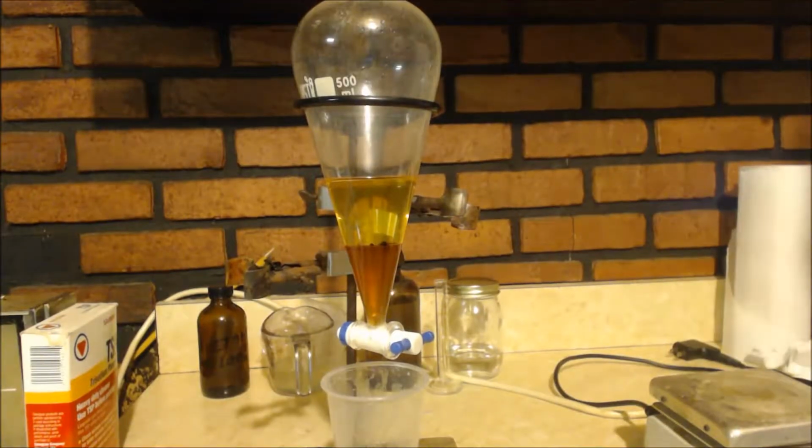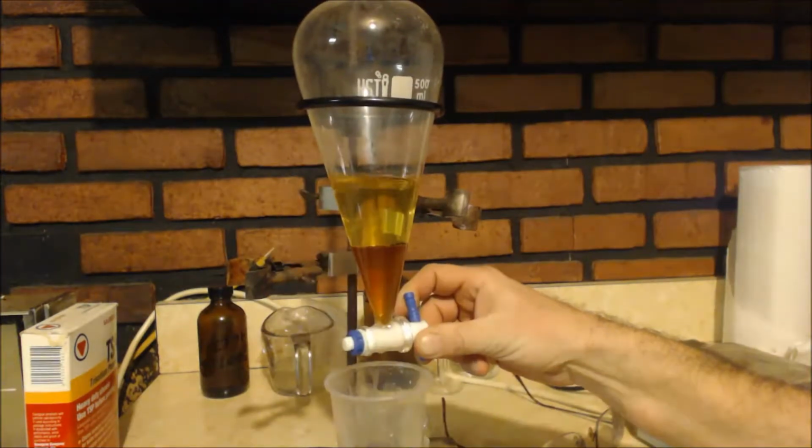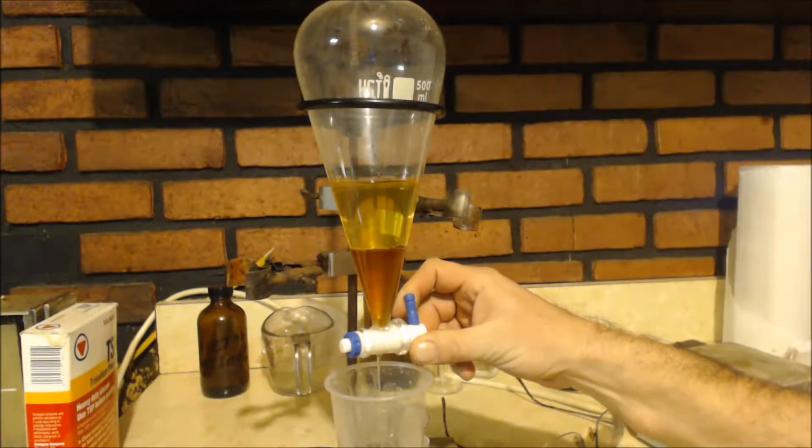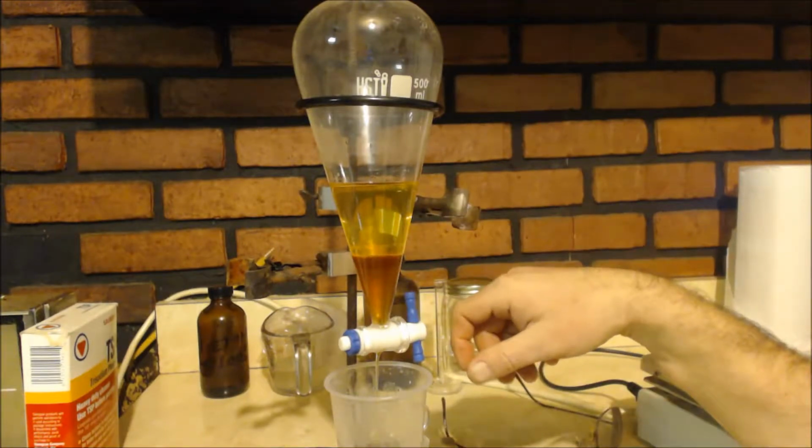I don't know if you can see it on camera, but it's starting to turn red now. See that red color by the magnet there? Watching, when I shake it, it turns yellow, but I don't see the red around the magnet. So it's polymerizing something and getting rid of it. That's good. And it's soaking up the water. Alright, so I let that stir for a couple hours. And I let it sit in this sep funnel for, I don't know, a half hour or something like that. It's orange now.